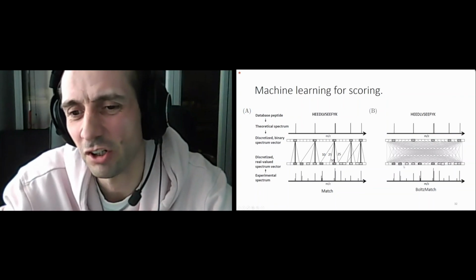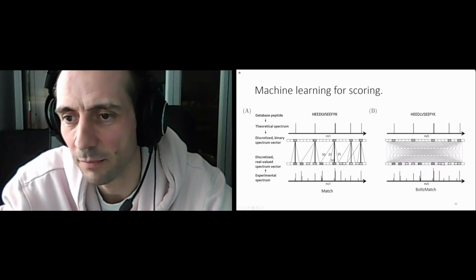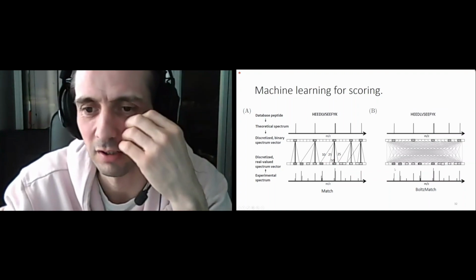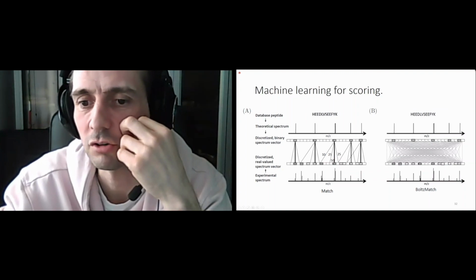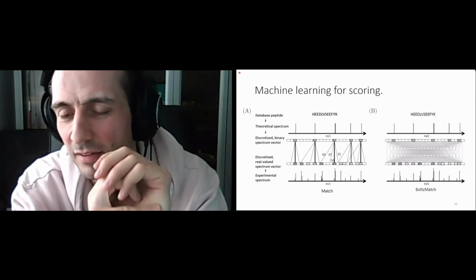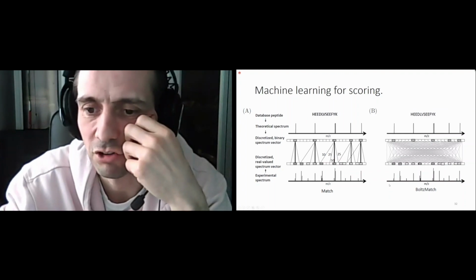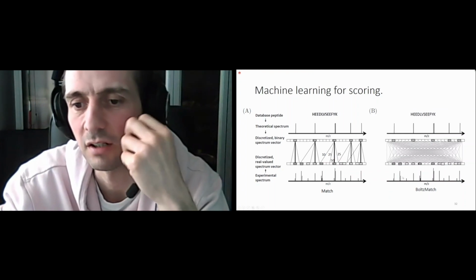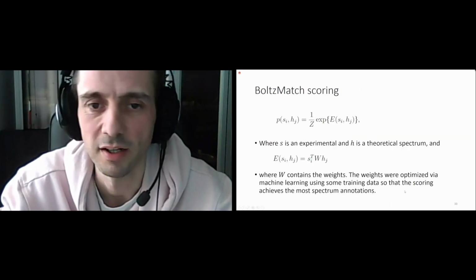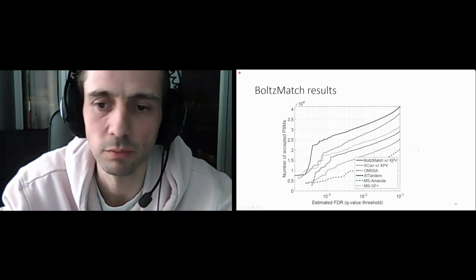You don't really need to consider a peak and then something very far from it, because probably there is no strong correlation. With convolutional neural networks, you can have just 100 or a few thousand parameters, and it focuses only locally on the neighboring region in the vicinity of a peak. And then it's much more robust to train than this Boltzmann machine.